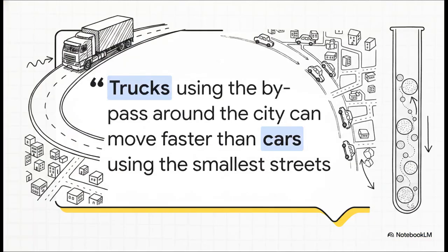So, size exclusion chromatography, which you might also hear called gel filtration if you're using an aqueous mobile phase, or gel permeation with an organic one, is actually kind of an outlier in the chromatography world. Why? Because instead of relying on chemical affinity or electrical charge, the migration velocity of a component depends entirely on its physical size, and, indirectly, its molecular mass.